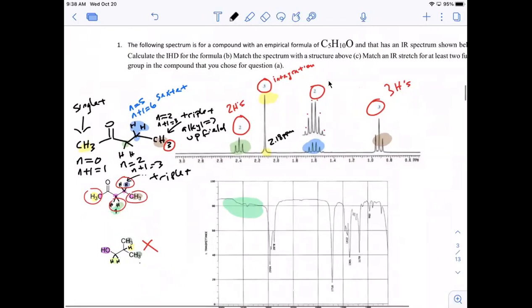I want to talk about the infrared too, because down below, that's what we call an infrared spectrum. And I sent the infrared video as an introduction, and hopefully we'll have a chance to go through infrared again, to reinforce what was in the video.